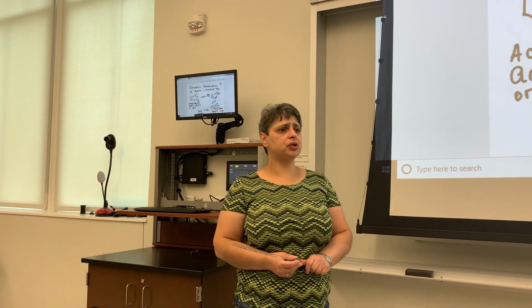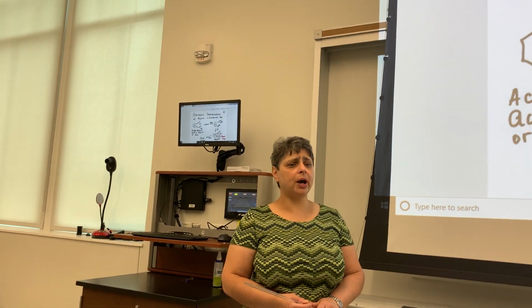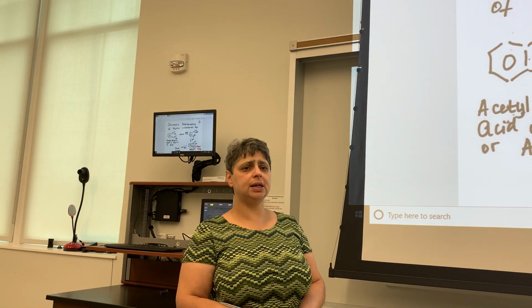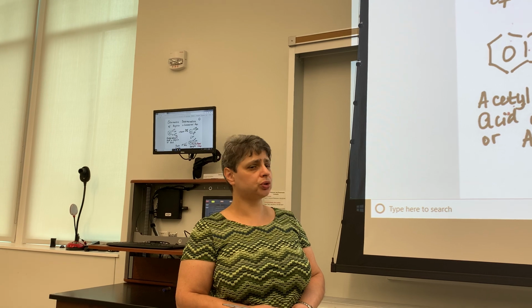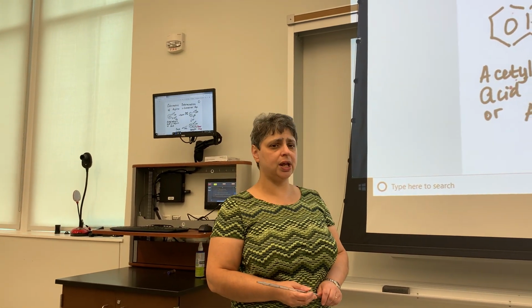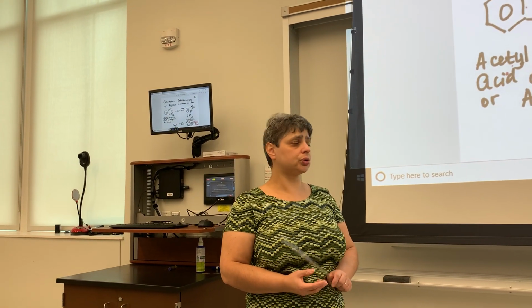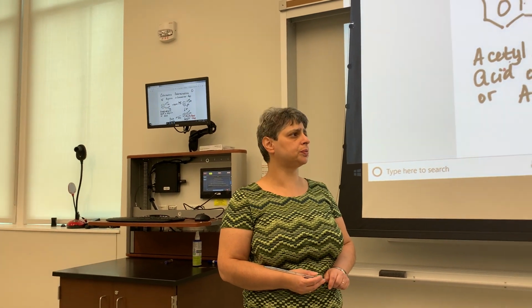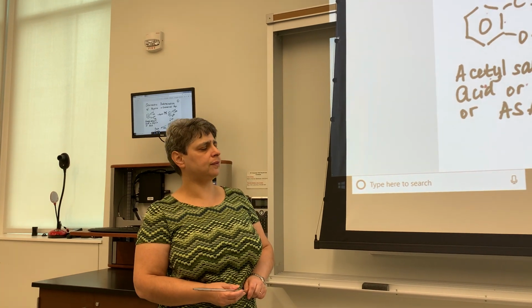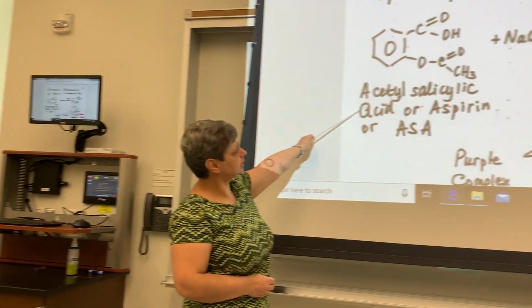I told you that when measuring absorbance in the visible range of the electromagnetic spectrum, one required parameter which you can assess quickly using your eyes as an instrument is the color. The substance or solution will only absorb light in the visible range, assuming it is colored. If a substance or solution is colorless, then it means it absorbs equally, or doesn't absorb, along the entire wavelength range. So here we're dealing with acetylsalicylic acid.